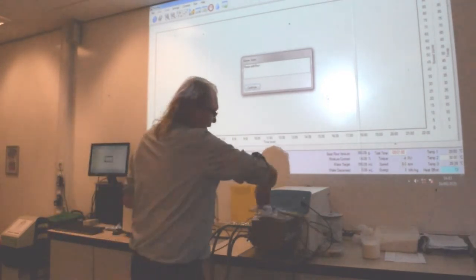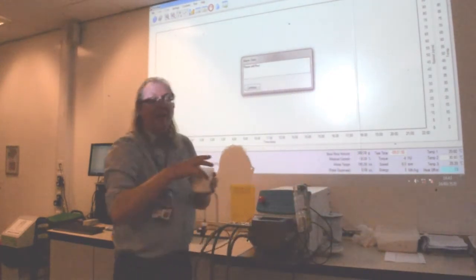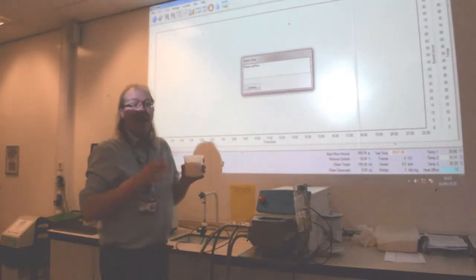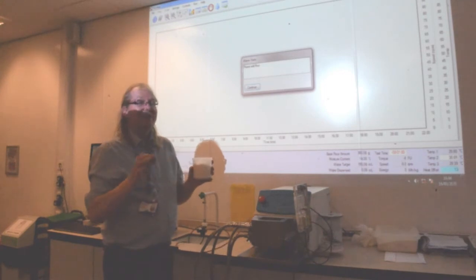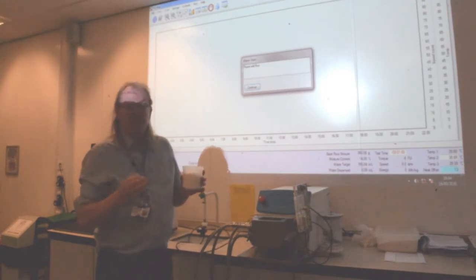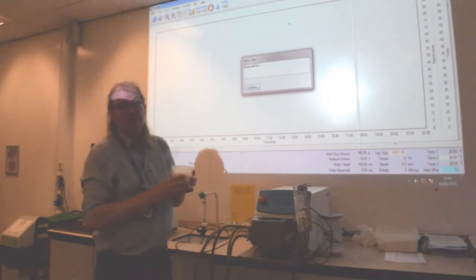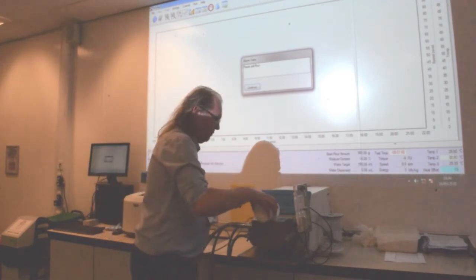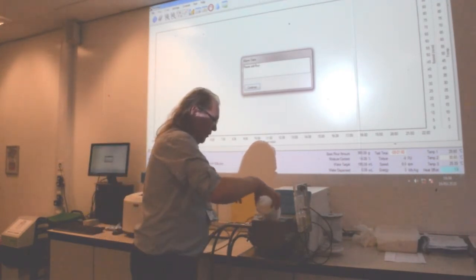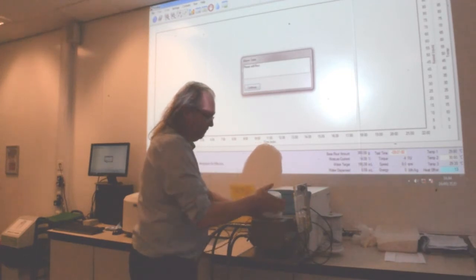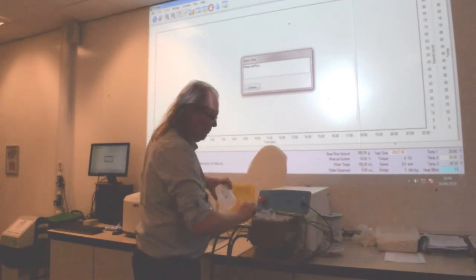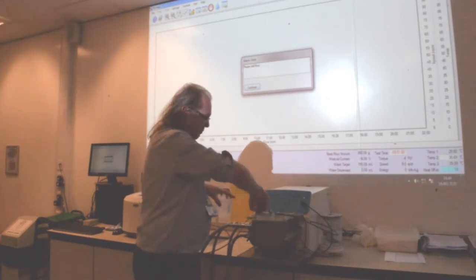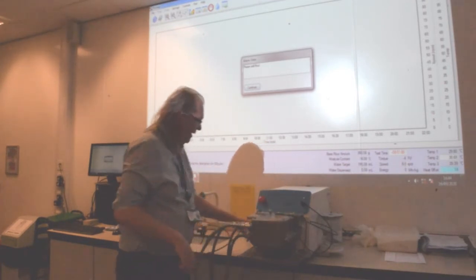The flour sample is measured at exactly 300.0 grams. It does need to be very accurate to make sure you get a clean, accurate result. All of that sample goes in the mixing chamber, then the top, put down and locked into place.